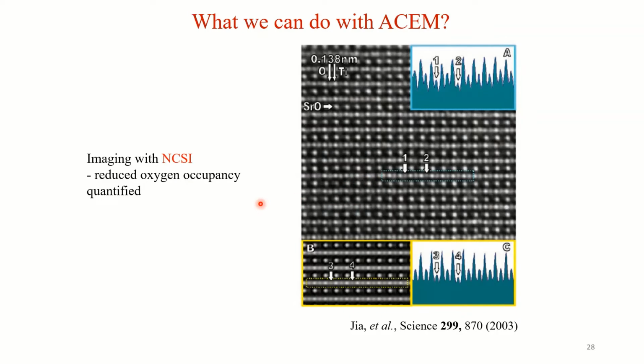The application of that is, especially in in situ transmission electron microscopy, for people working with catalysis. They often deal with water splitting reactions and carbon sequestration, conversion of CO2 into fuels, which involve low Z elements, including oxygen and hydrogen. Or if you're imaging boron nitride or gallium nitride, then you have to locate the low Z elements. In that case, this NCSI imaging was very useful.